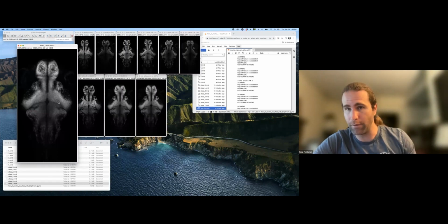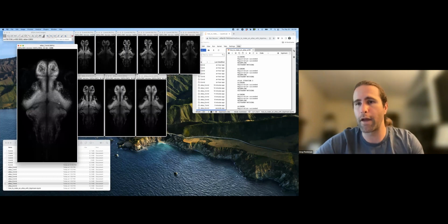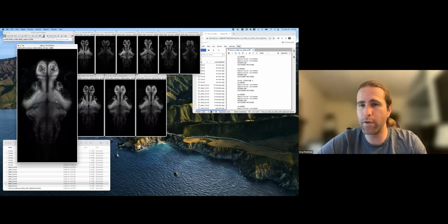Maybe I have other channels, like staining of a specific set of cells. Maybe I have ROIs determined by functional imaging or transcriptomics or something like that. Now they're all registered to the same place where we have one image that's representative of the population.